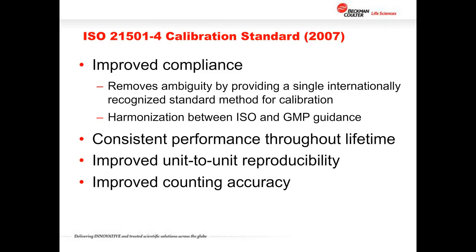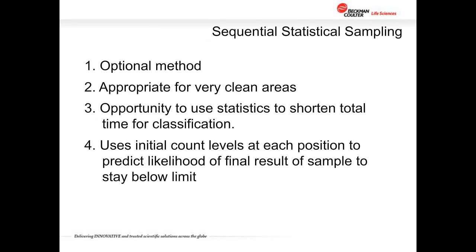It's reproducible no matter who does it and if an appropriate instrument is always used. I want to mention one other tool that's hidden, if you want to say, inside of the standard. And this was actually there in the earlier standard, in the 1999 standard, and even in the federal standard. That often helps speed up the test for some applications, but not all, as we'll see.